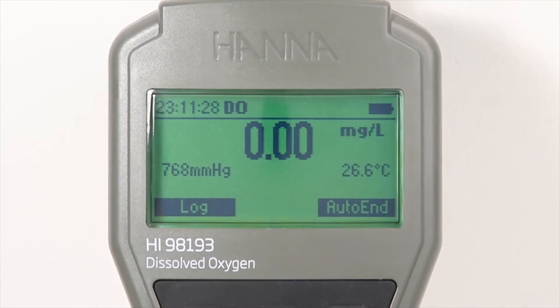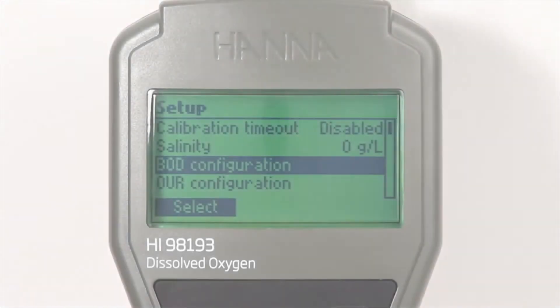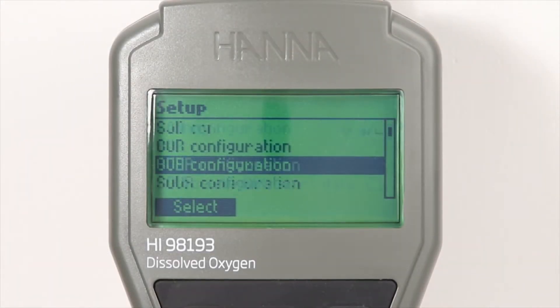Measurement modes of DO in milligrams per liter and percent saturation can be switched with the push of a button. Measurement options such as the setup parameters for performing a BOD, OUR, or SOUR test can be fully customized through the setup menu.